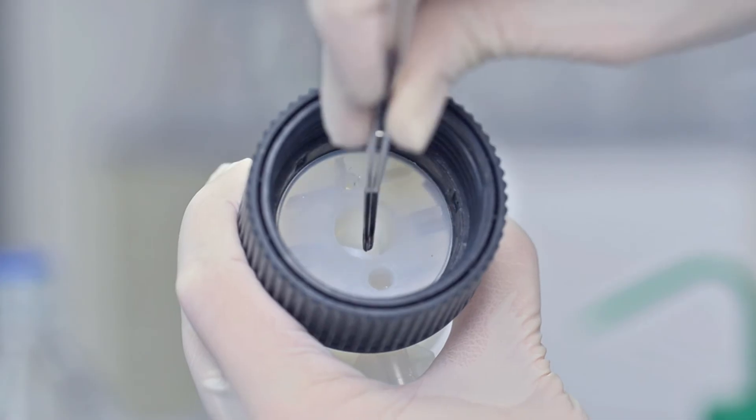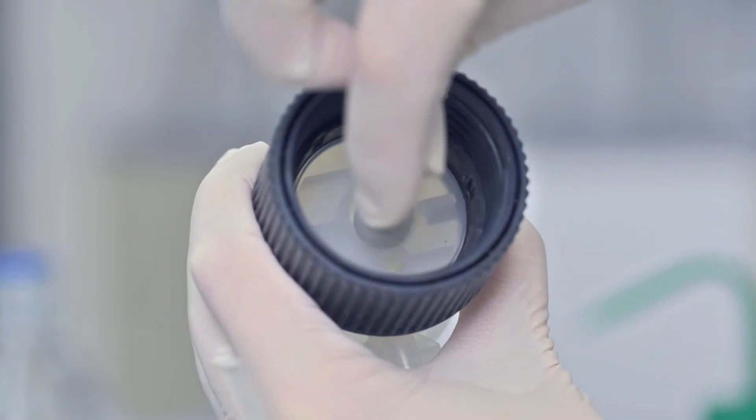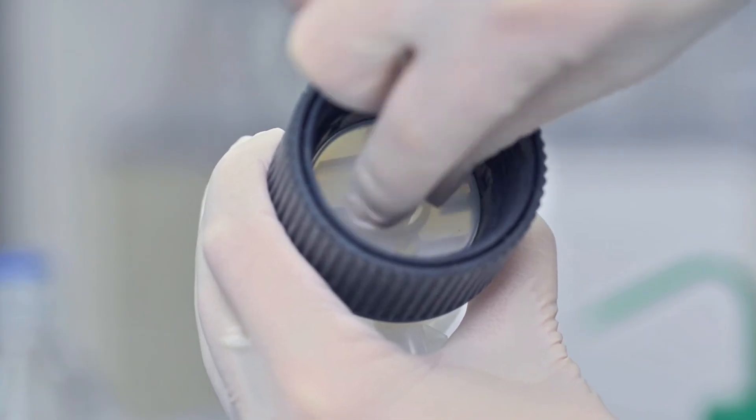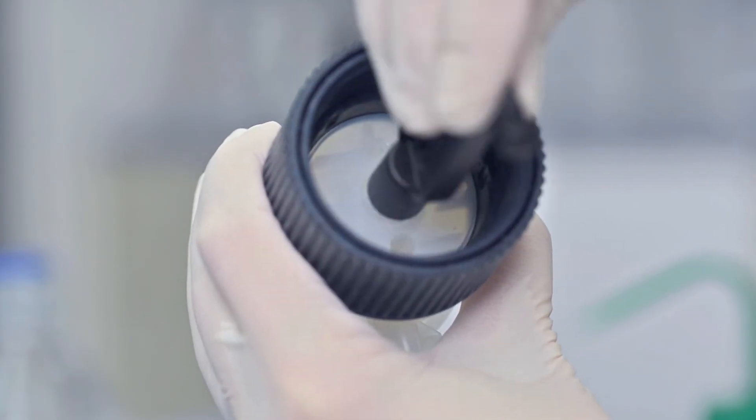Reinsert the clean seal. Then screw in the filling valve by hand and secure it by a quarter turn with the mounting tool.